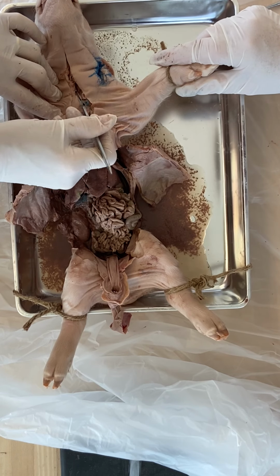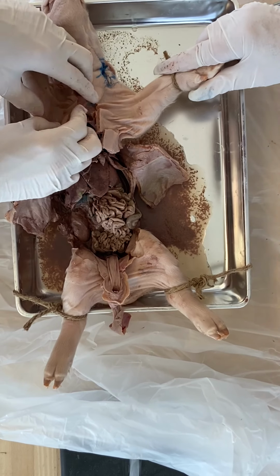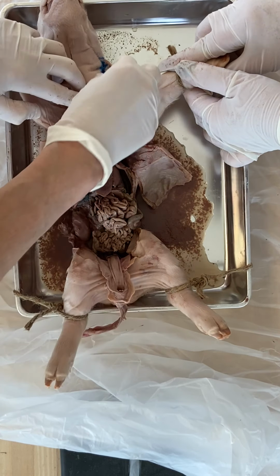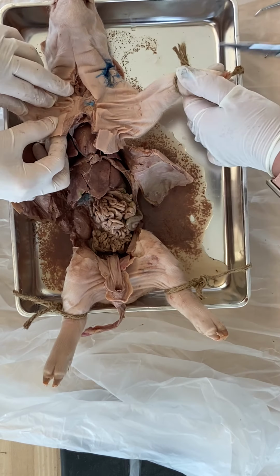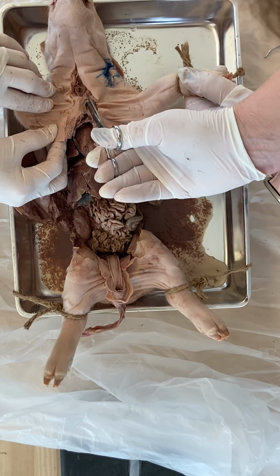That must be quite a job finding the vein to inject the dye. How do they do it? I was going to say, because I see the red dye. It looks like it's through the neck. Through the neck there, yeah. Okay. Imagine having that job, huh? What do you do for a living? Oh, I inject blue and red dye into dead piglets.